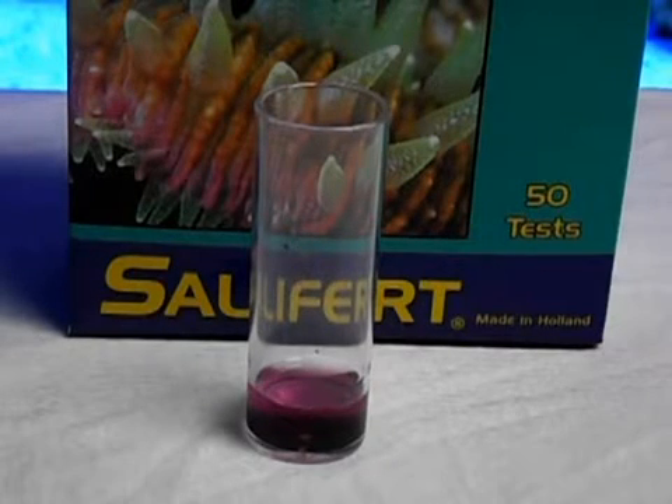The next step is to start adding the magnesium three until the color changes to gray or blue, whichever color is observed first.